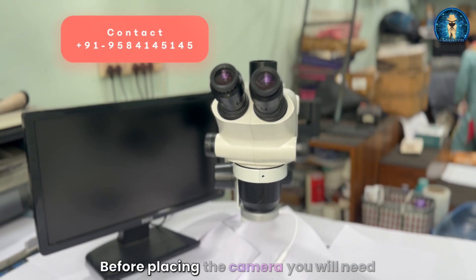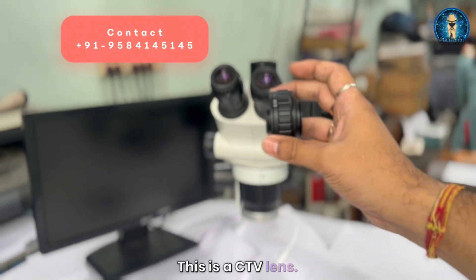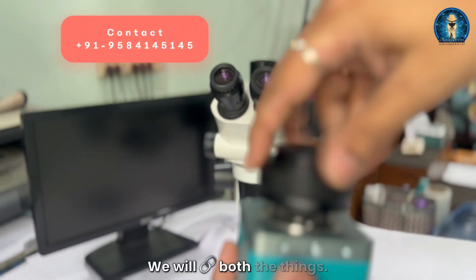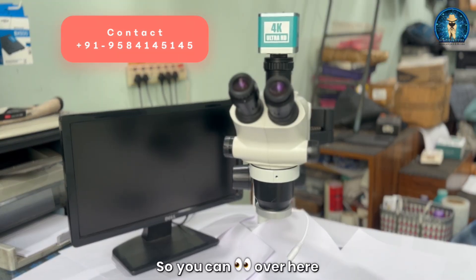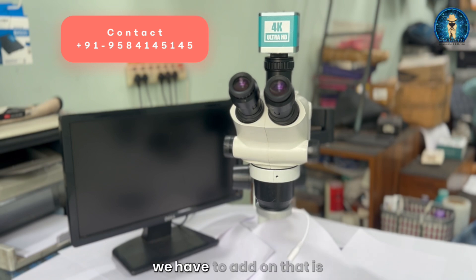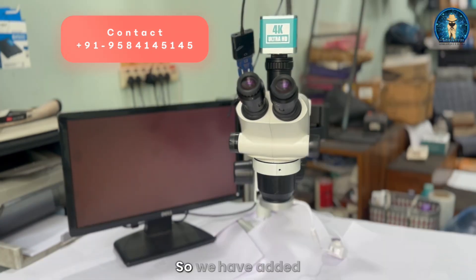Before placing the camera, you will need the CTV lens — without this you cannot place the camera. We are going to use the CTV lens for placing our camera and will attach both things together. Now we place the camera. You can see our scope is almost ready to display. A few things remaining are adding power to the light, the camera, and the monitor.